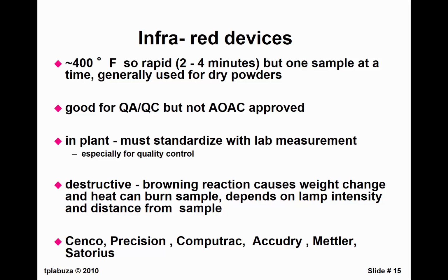You get the browning reaction, the Maillard reaction occurring, which causes problems, and the sample can burn at some point. So you have to be very careful. You have to standardize. You may have to change the bulb so you get a lower temperature.